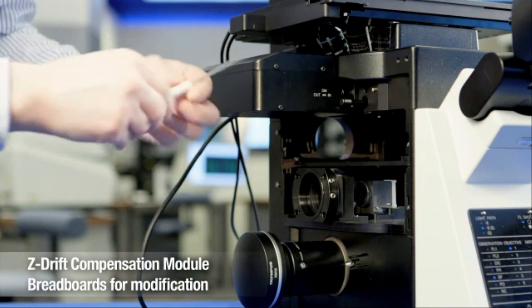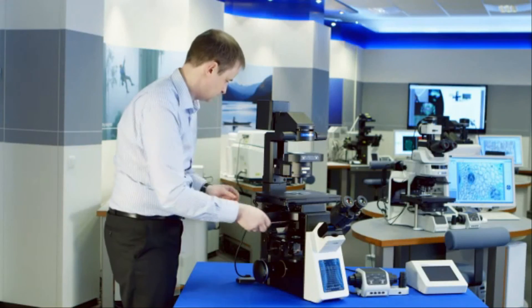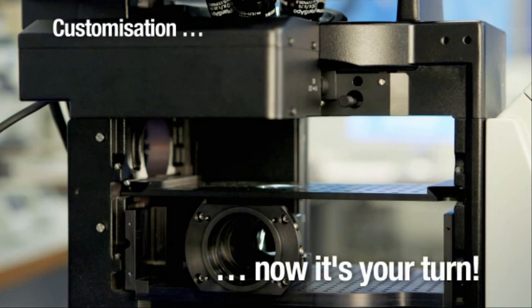Who knows where this handing over of system design to the microscopy community will lead? It will certainly push the boundaries of new technologies. Visit us online today to discover where the Olympus IX3 range will lead you.